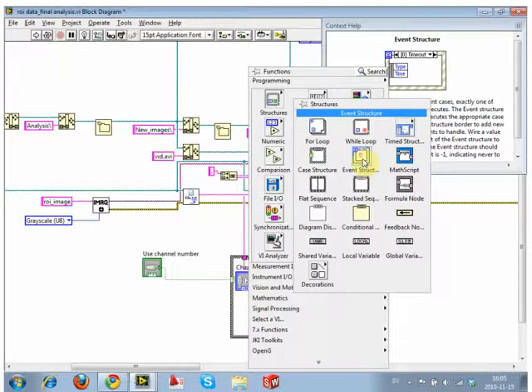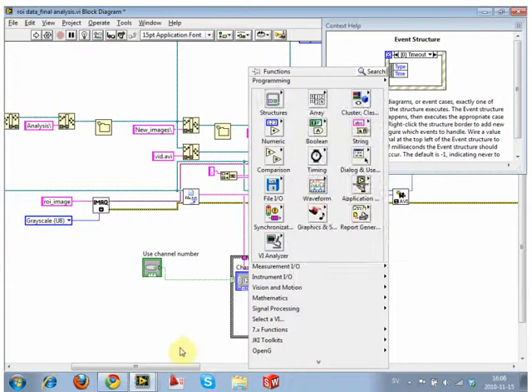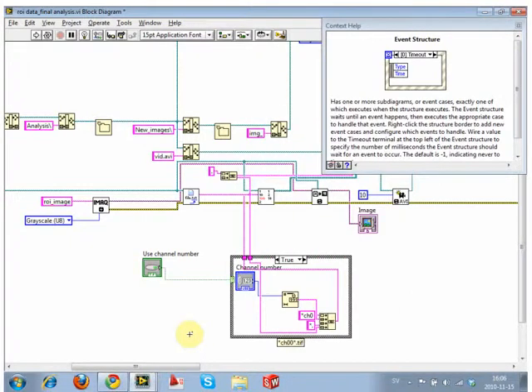That's the way that you do it. Most of the time, lots of the things that you actually need to do are true/false statements. But I was just thinking about the possibility to keep the option of defining the filter yourself. So yeah, you totally could do that. You can give it an extra option with a radio button, and say, choose it, don't choose it, or use confocal.